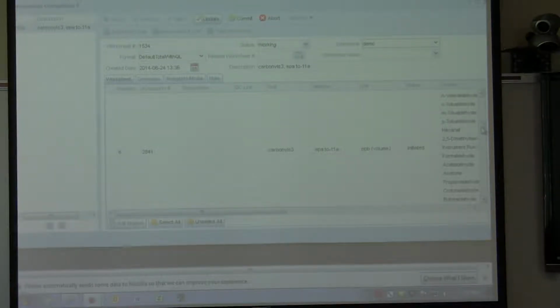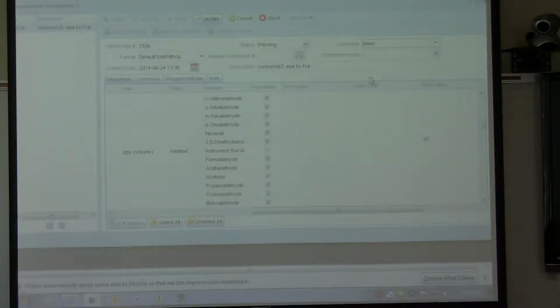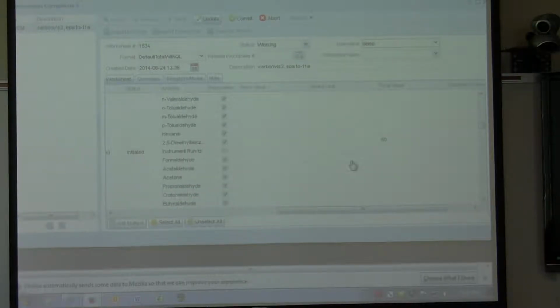I have a question, Matt. Yeah, that edit multiple, is that only for numbers? Can we edit the compounds right there, add compounds? It's only for the column values out here. Okay. So it's not just numbers, it's numbers if they have dictionaries on them or other things. Right, no, it's not for messing with the analytes. Okay. No, it's just for putting your values in.